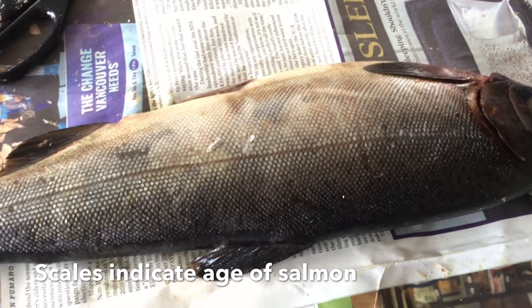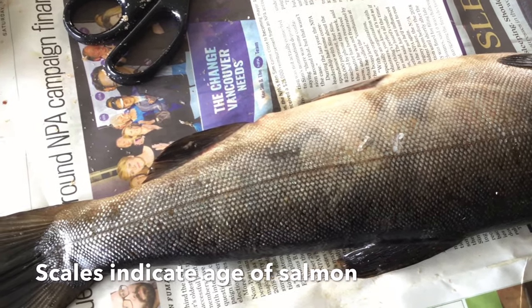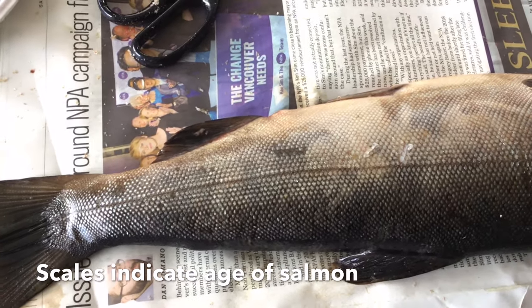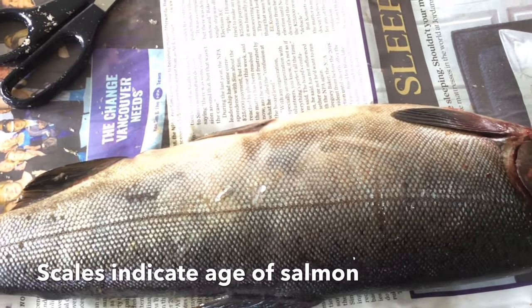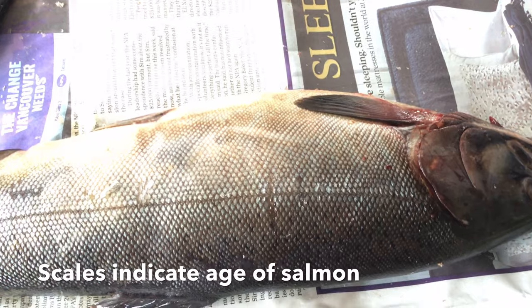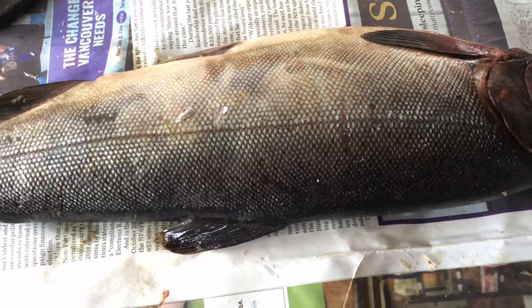That means this salmon is 3 years old. Three groupings of lines. Not each line, but groupings of lines. A little bit different than trees. And salmon have the same number of scales for their whole life. And if they lose a scale, another one grows in to replace it.